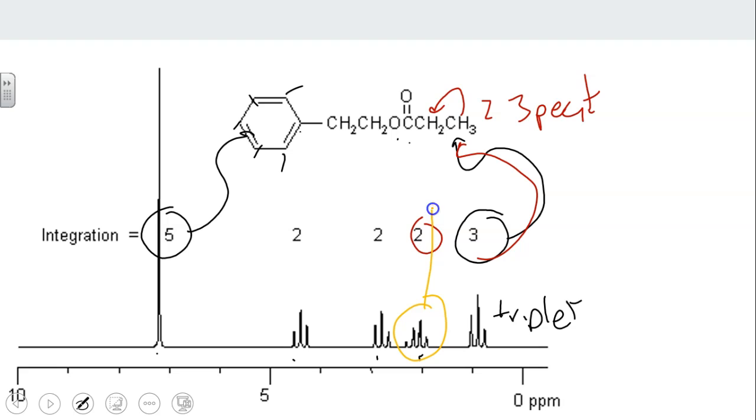So this can only be one of the peaks. This must be this carbon right here. Because again, if we look next to it, it has 3, so that means it's going to couple into 4 different peaks. It's a quartet. So that's 3 of the peaks completely interpreted.